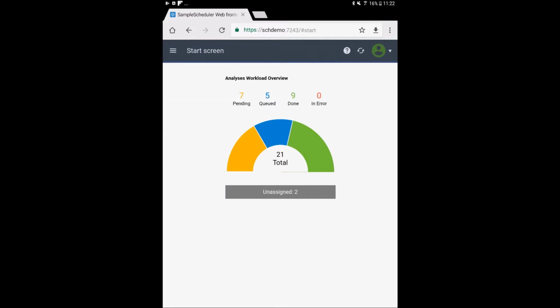He doesn't want to see all analysis, nor all instruments in the lab, nor is he interested in the overall performance. He has a tray with 5 samples that were registered in the LIMS and are assigned to him.